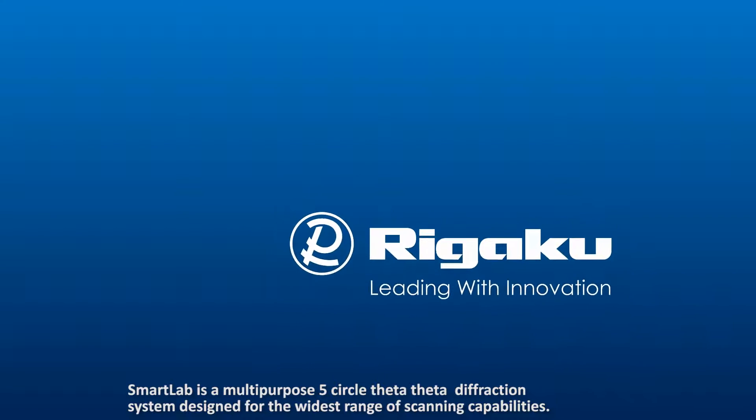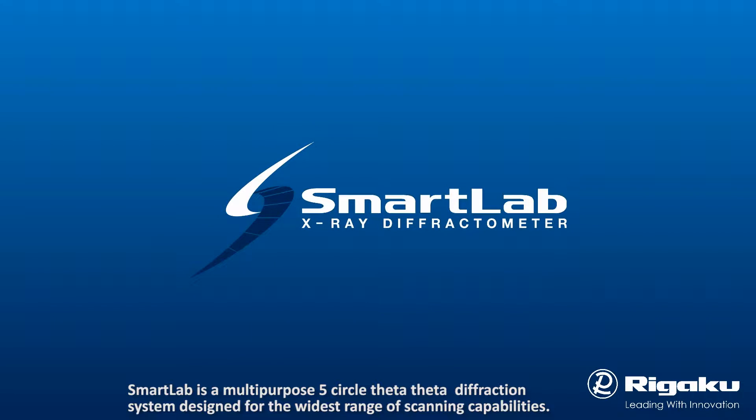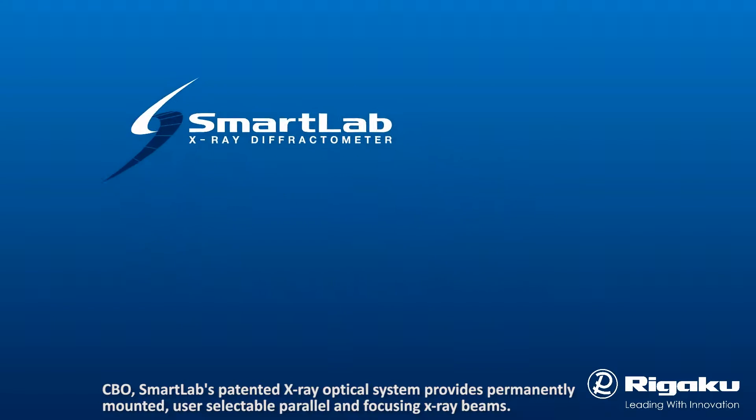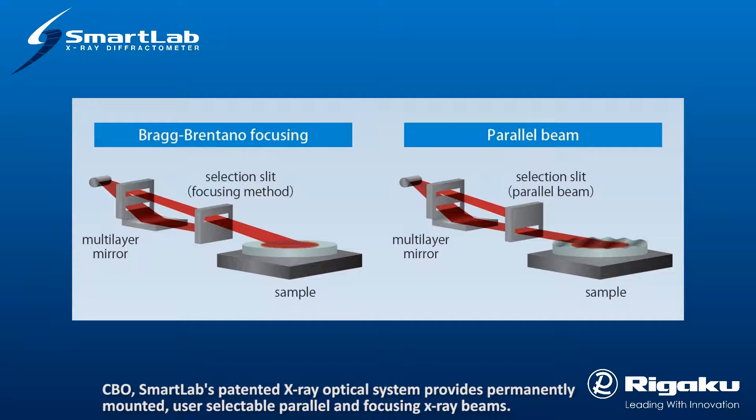SmartLab is a multi-purpose five-circle theta-theta diffraction system designed for the widest range of scanning capabilities. CBO, SmartLab's patented X-ray optical system, provides permanently mounted, user-selectable, parallel and focusing X-ray beams.